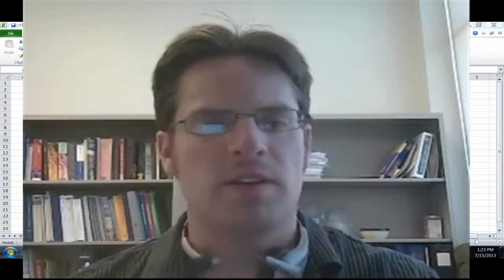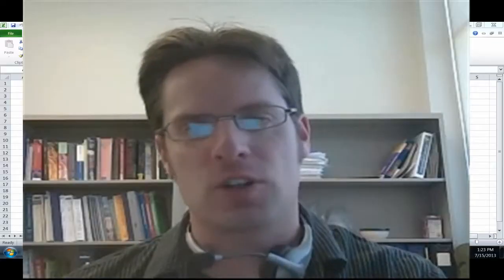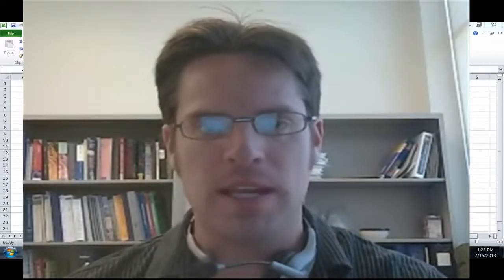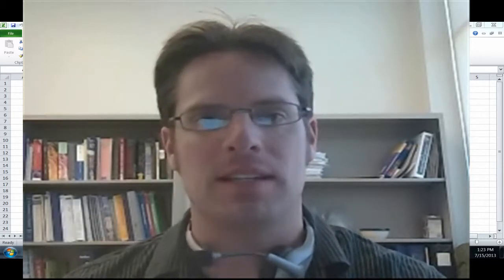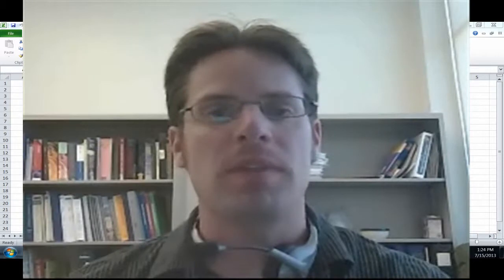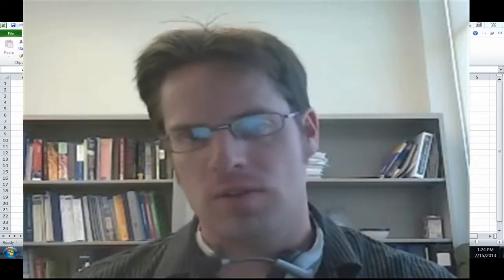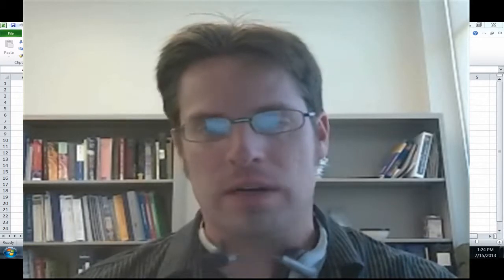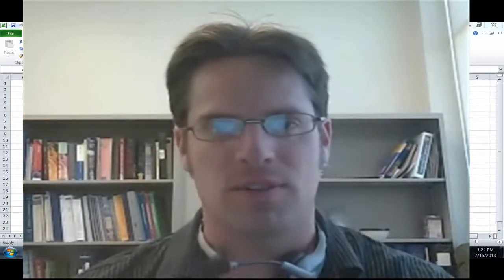The following is a brief and hopefully clear instructional video detailing an electrolysis experiment that we conducted with 6th and 7th graders for the USU Uinta Basin 2012 summer camp. It is my hope that this set of video instructions will be clear enough for you chemistry teachers out there who are interested to be able to duplicate this procedure with your students successfully.